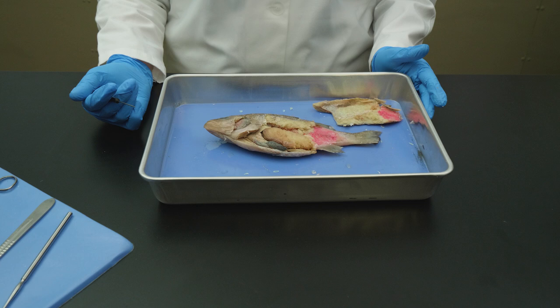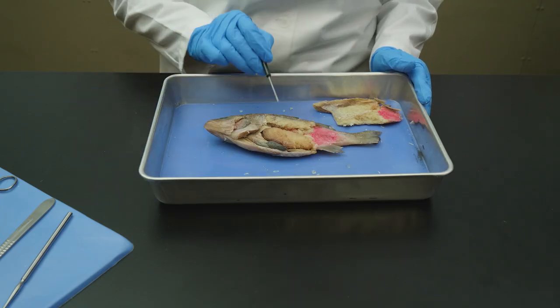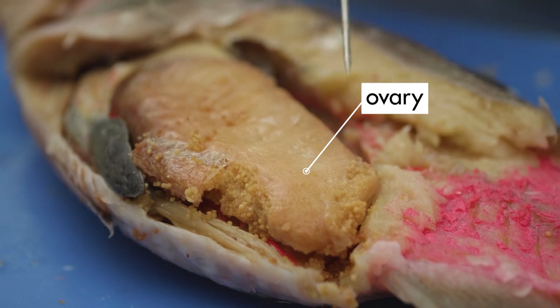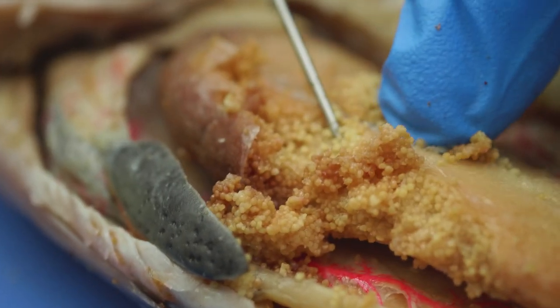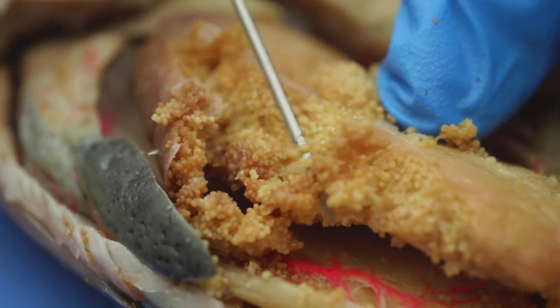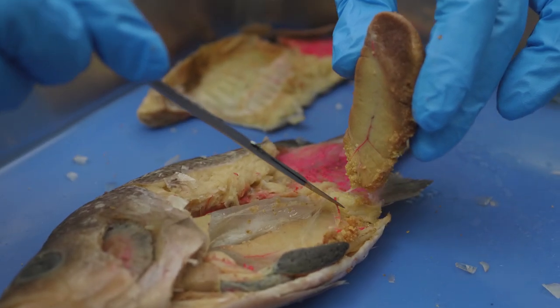Now, let's examine the reproductive, digestive, and circulatory systems of the perch. Earlier, we said we were not certain whether this was a male or female perch, but now we are certain it is a female because we can see the ovary. The ovary is filled with thousands of eggs. If we open up the ovary, we can see some of the eggs. When eggs are released from the ovary, they pass through the oviduct and out through the urogenital opening. We need to remove the ovary so we can see some of the other internal organs.